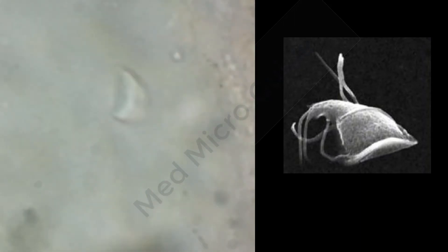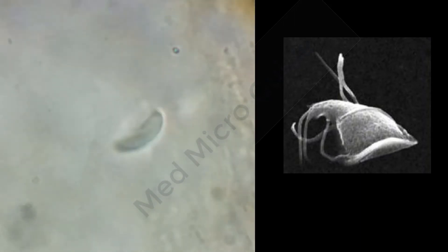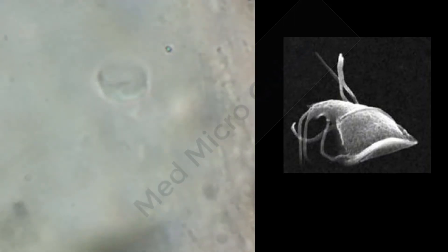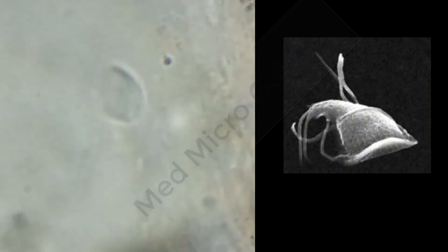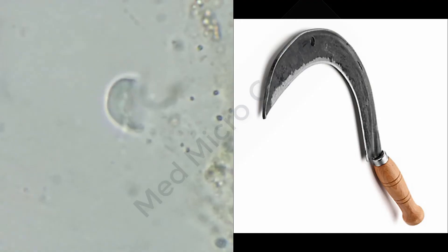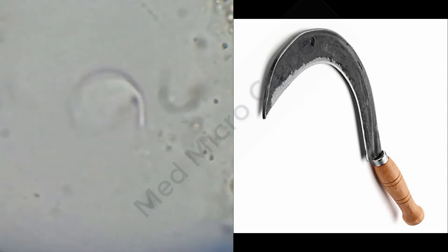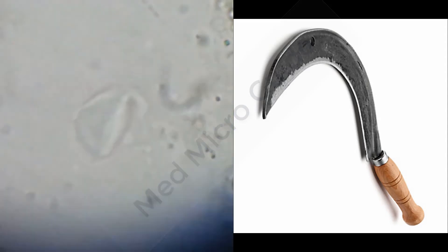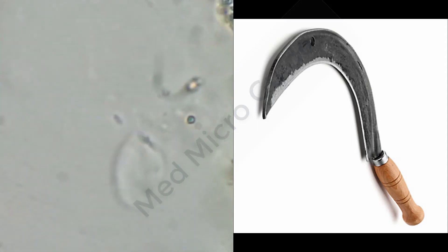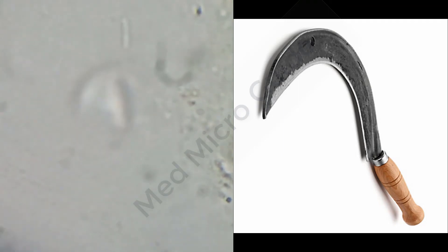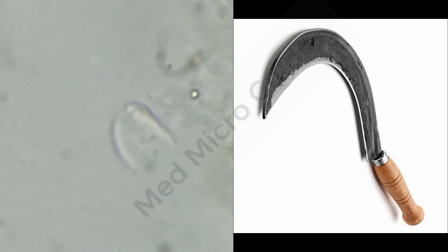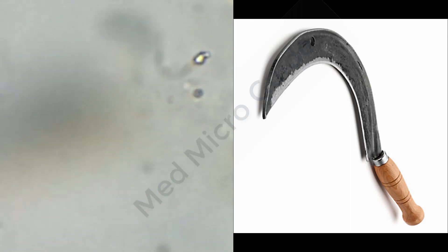Almost because of a long time, the parasite has become sluggish. You can observe the shape of the parasite — it looks like the shape of a sickle. So that gives a characteristic morphology of trophozoites of Giardia lamblia.